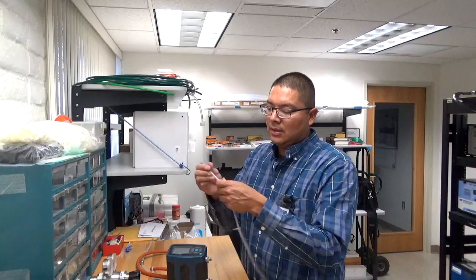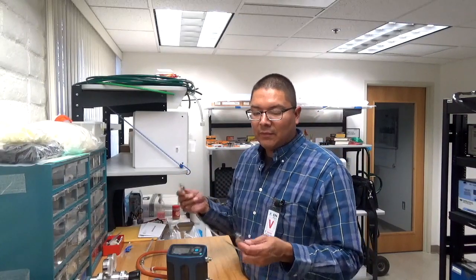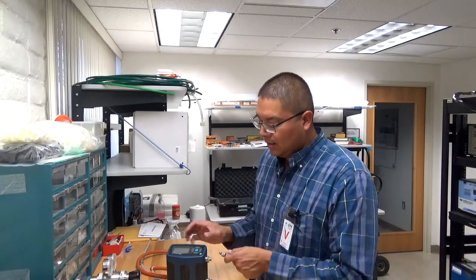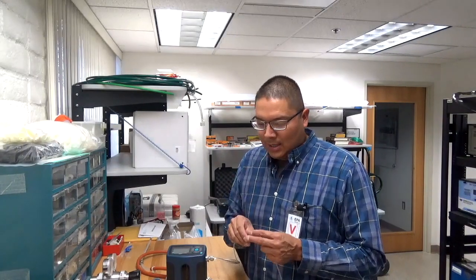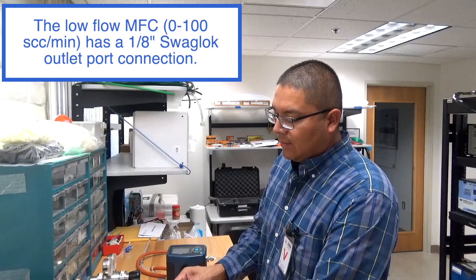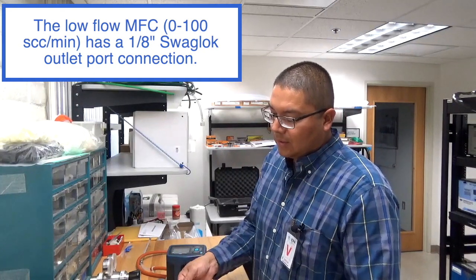I have a flexible, non-toxic PVC flexible tubing — it's a quarter inch outer diameter, so I put on quarter inch swage locks and ferrules onto the ends so I can connect from the external flow meter to the mass flow controller within the calibration unit. One of the mass flow controllers has a port that is one-eighth inch, so I had to use a reducer to reduce my quarter inch connection on the flow meter to the one-eighth inch connection on the port on the mass flow controller within the calibration unit.